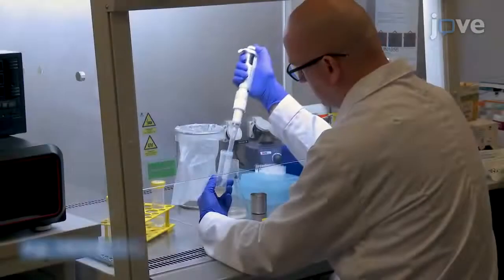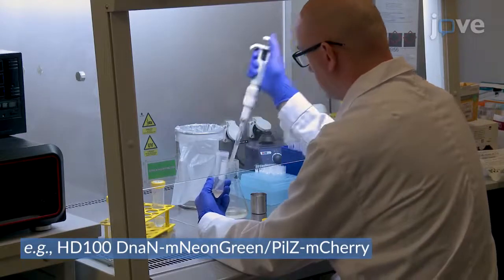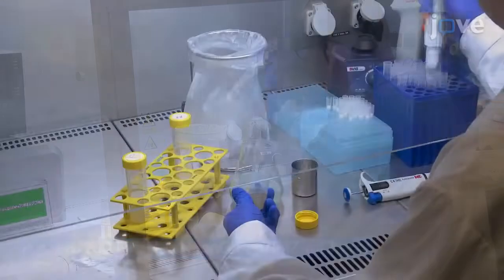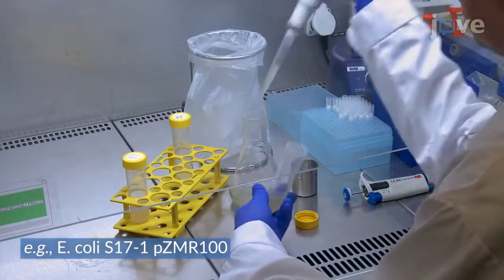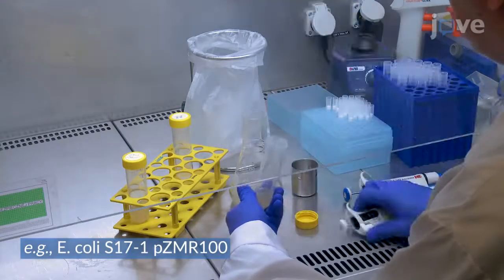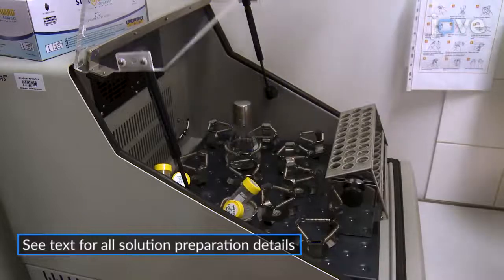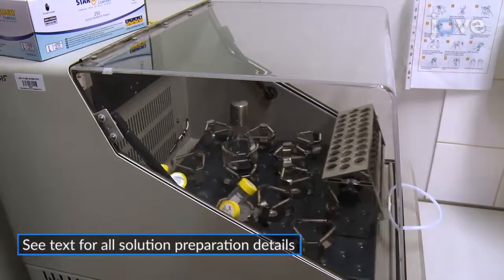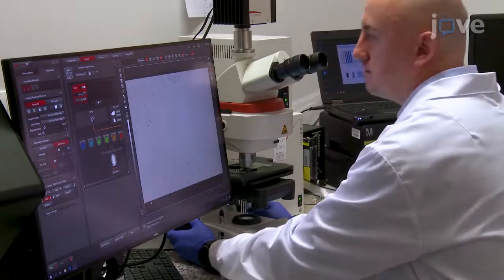To set up a B. bacteriovorus culture, combine 1 ml of fresh 24-hour cultured bacteria with 3 ml of overnight prey culture in a 250 ml flask containing 50 ml of calcium HEPES buffer supplemented with antibiotics as needed. After a 24-hour incubation at 30 degrees Celsius and 200 revolutions per minute, check that the prey cells have been fully lysed by liquid-mounted phase contrast microscopy.